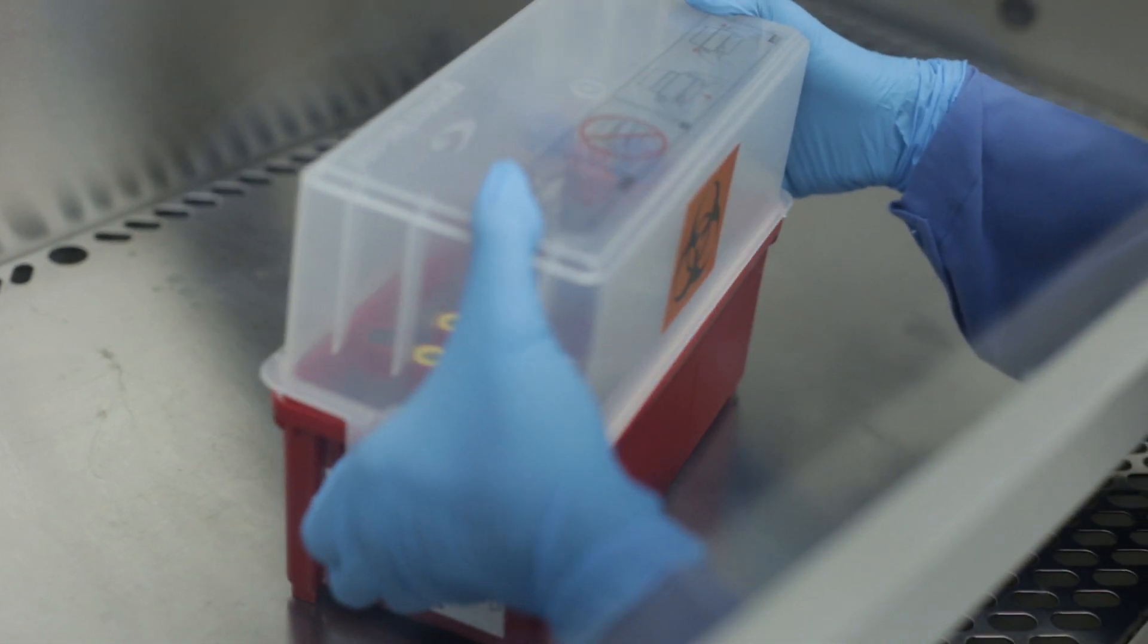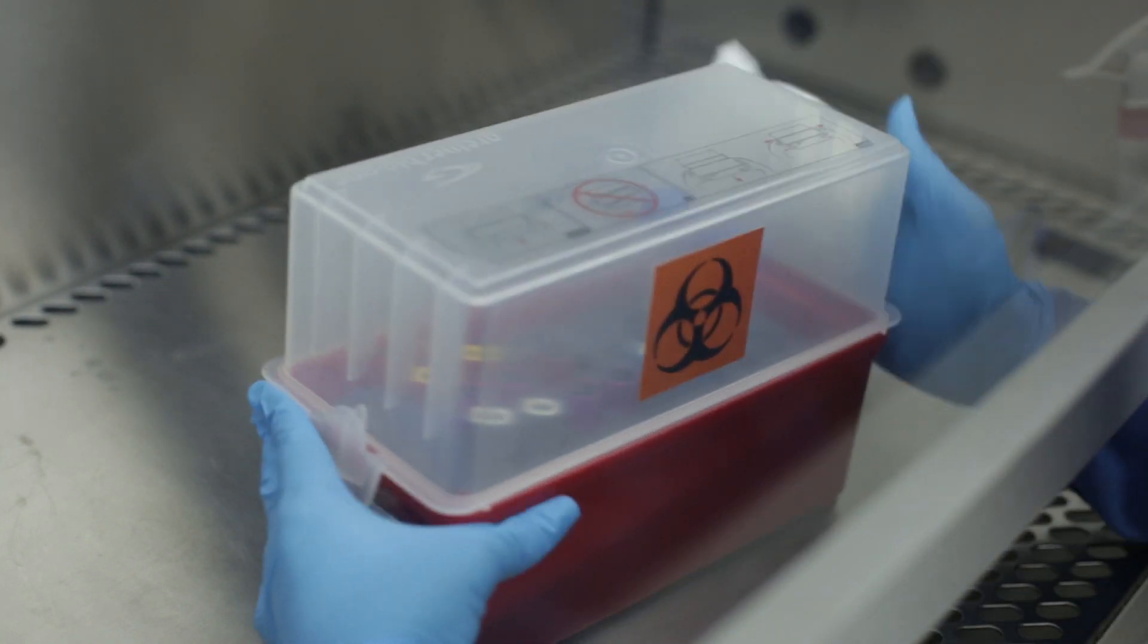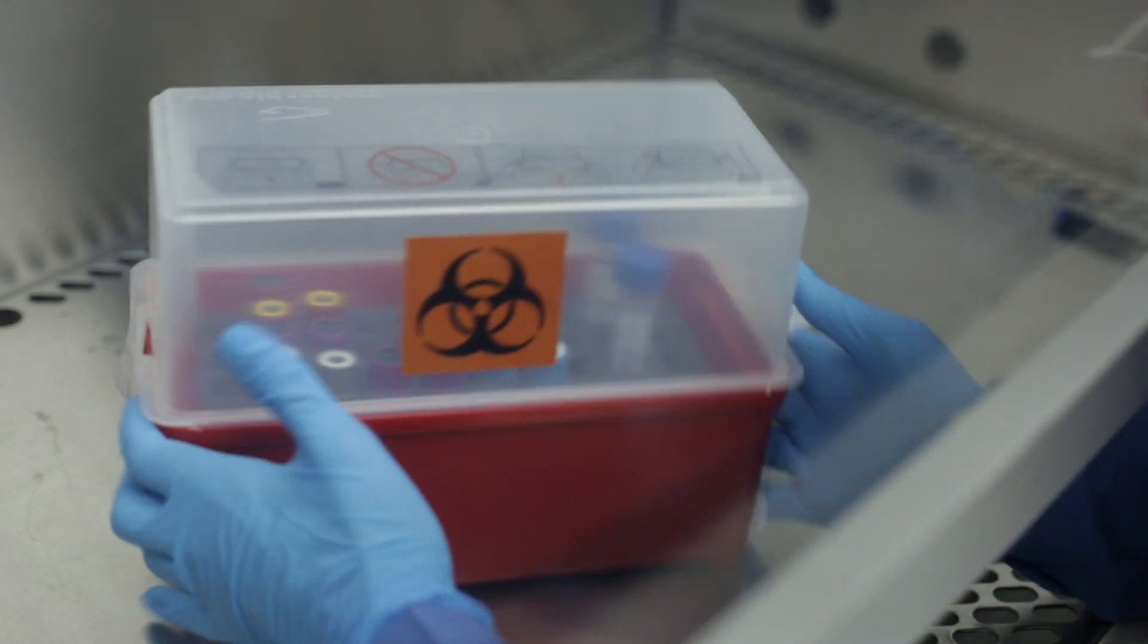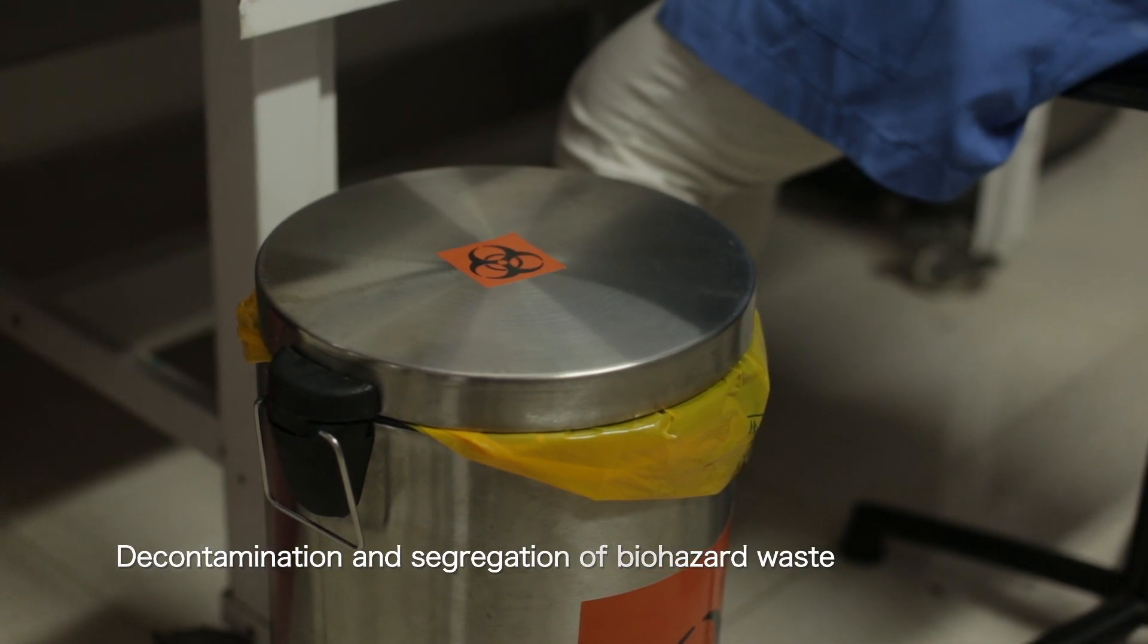Primary containers must be placed inside a leak-proof secondary container. Name of the laboratory and biohazard label must be displayed on the secondary container. The outer surface of the container must be decontaminated before transporting.